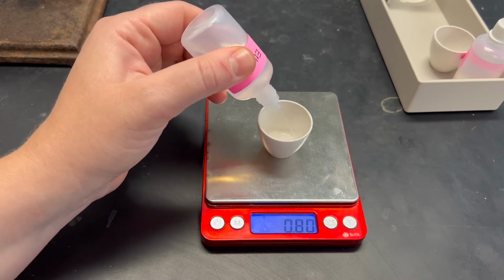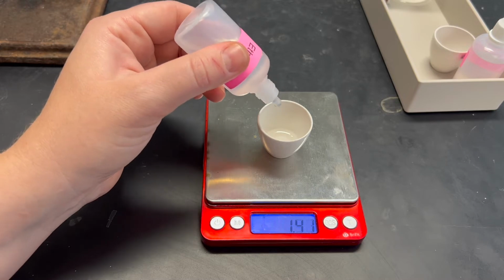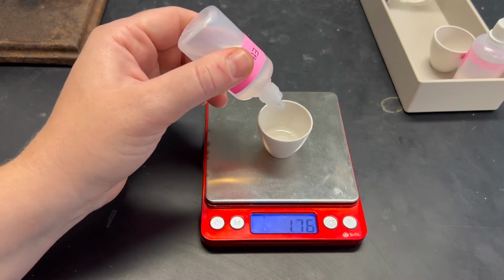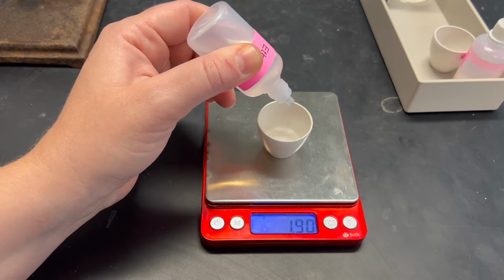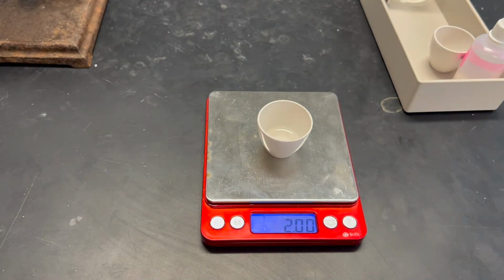Again, I'm going to go a little more quickly in the beginning, and then when I get closer to 2, I will do it drop by drop. Try not to go over because it's a little bit harder to get out than it is to put in. Now I'm going to go drop by drop. Wait for it to load. There we go, 2.0 grams.